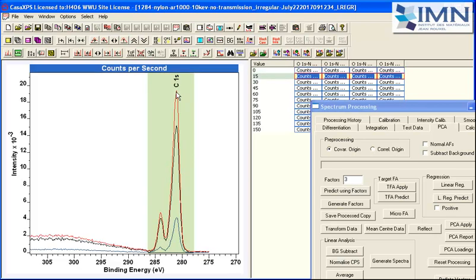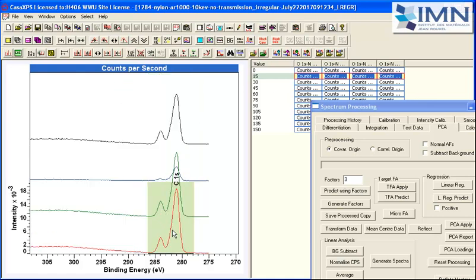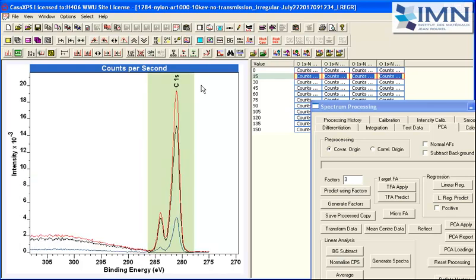So you can see there that I've now got two different proportions of these two spectral forms, both of which reproduce, because this is not just red, there's also a green spectrum here. If I offset them, you can see they're actually red and green. These are so close in terms of numerical precision that the sum of these two spectra produces this green one, and the red one is overlaid almost perfectly. So let's put that back so you can't see them.